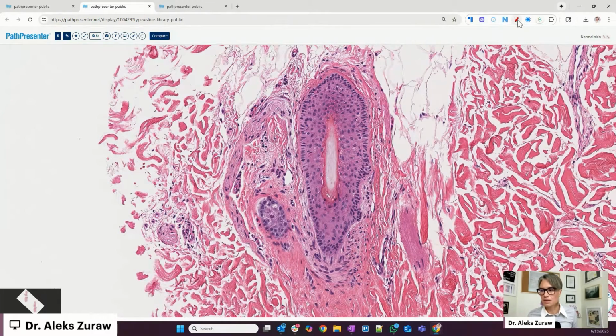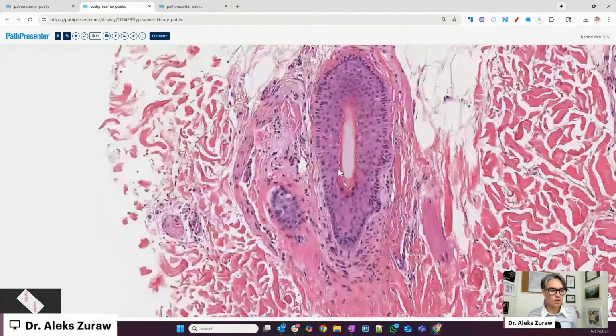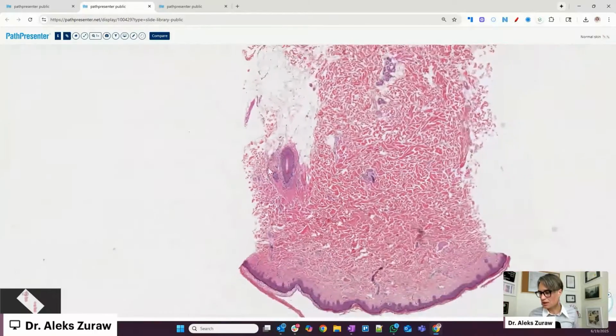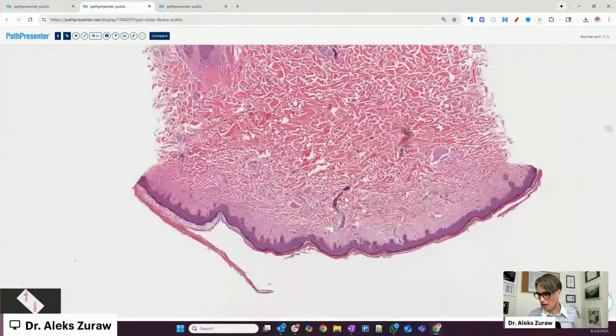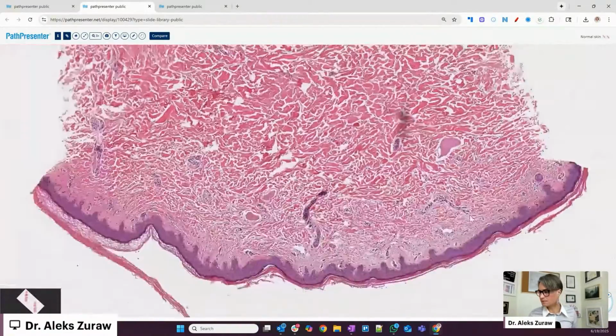But yeah, here, these cells are basically epidermal cells. This is the hair bulb, and this is the hair here inside. And when I find a bare hair for you, I'm going to make a histology video just on a hair follicle. For this one, I'm just going to leave you with that this is a hair follicle. Anything else interesting? No, we're good.